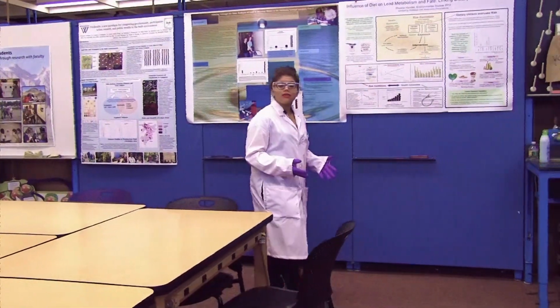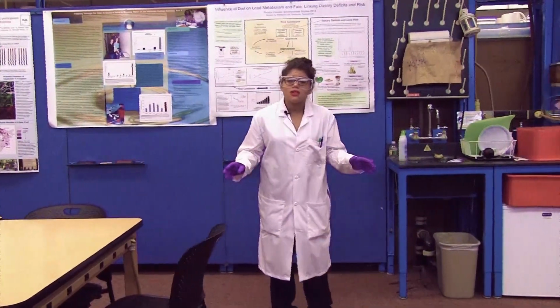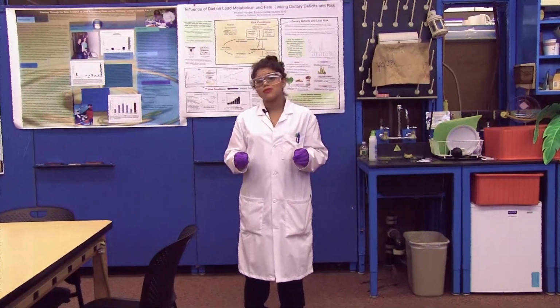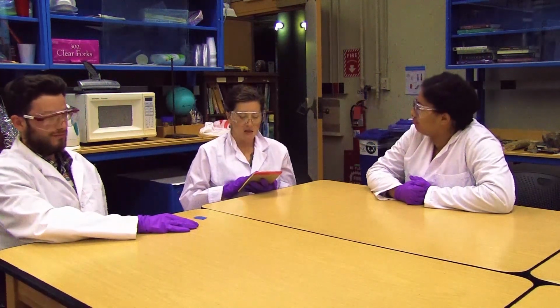I've assembled together a team of very experienced researchers here at the Science Center to talk about what they would do themselves in this particular experiment. Well, I took notes while we watched Wendy perform the experiment and noted all of the hazards. She's handling a caustic substance, a strong acid, and a boiling solution. She's also got glassware and a hot, powdery precipitate to move around.